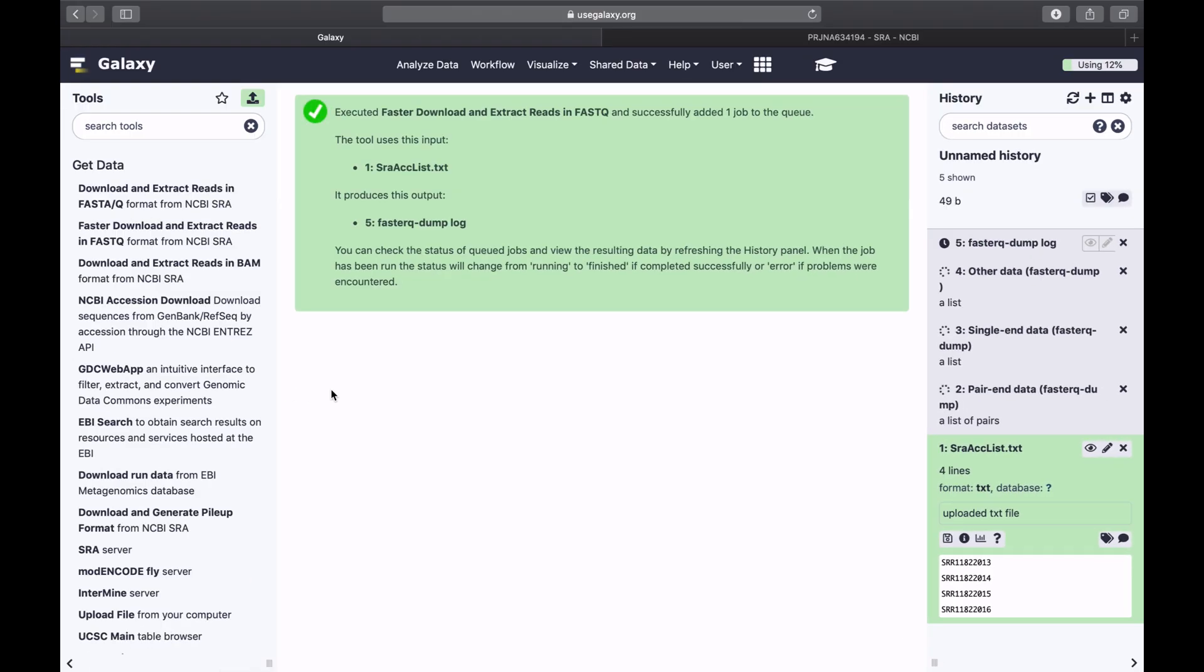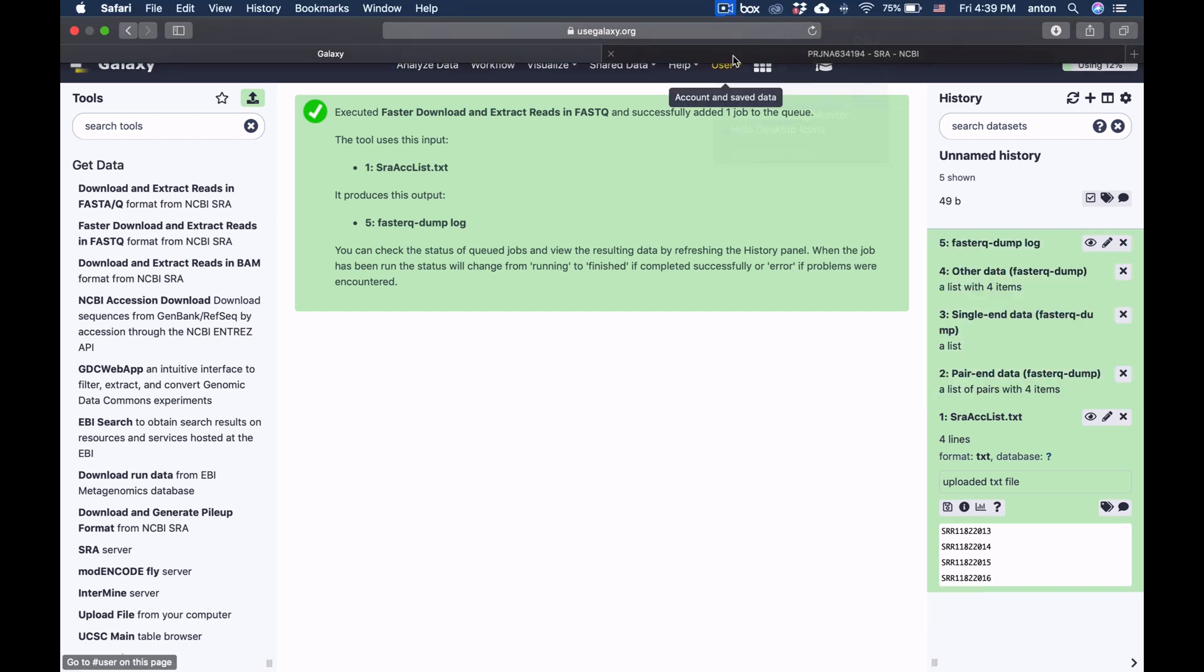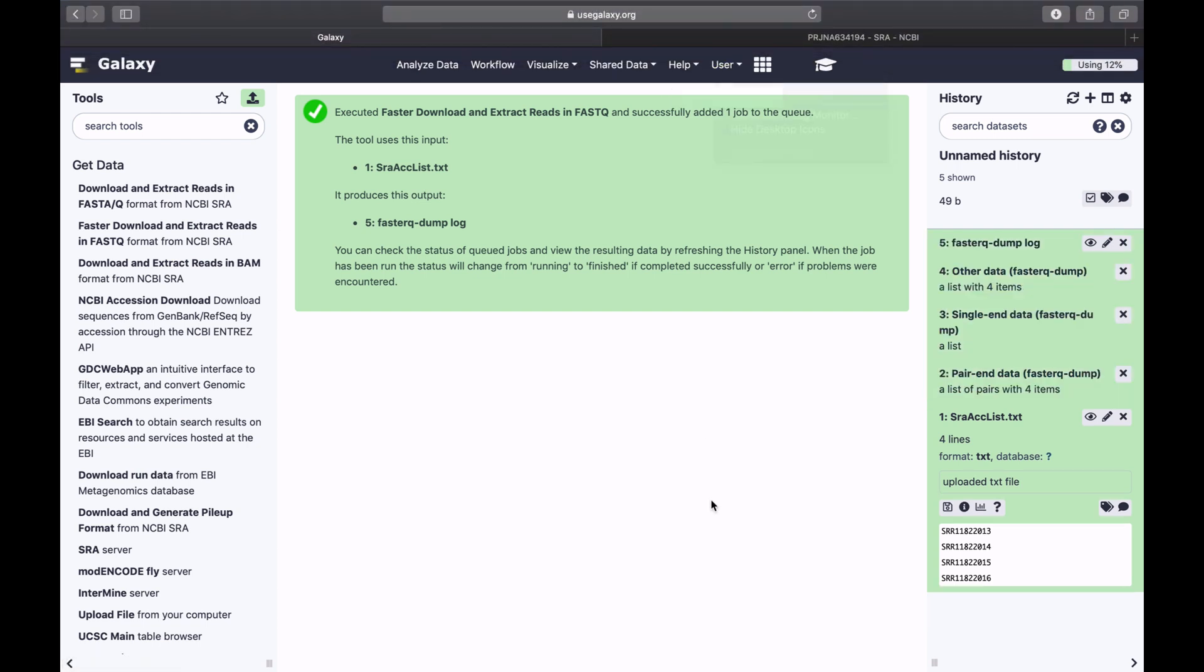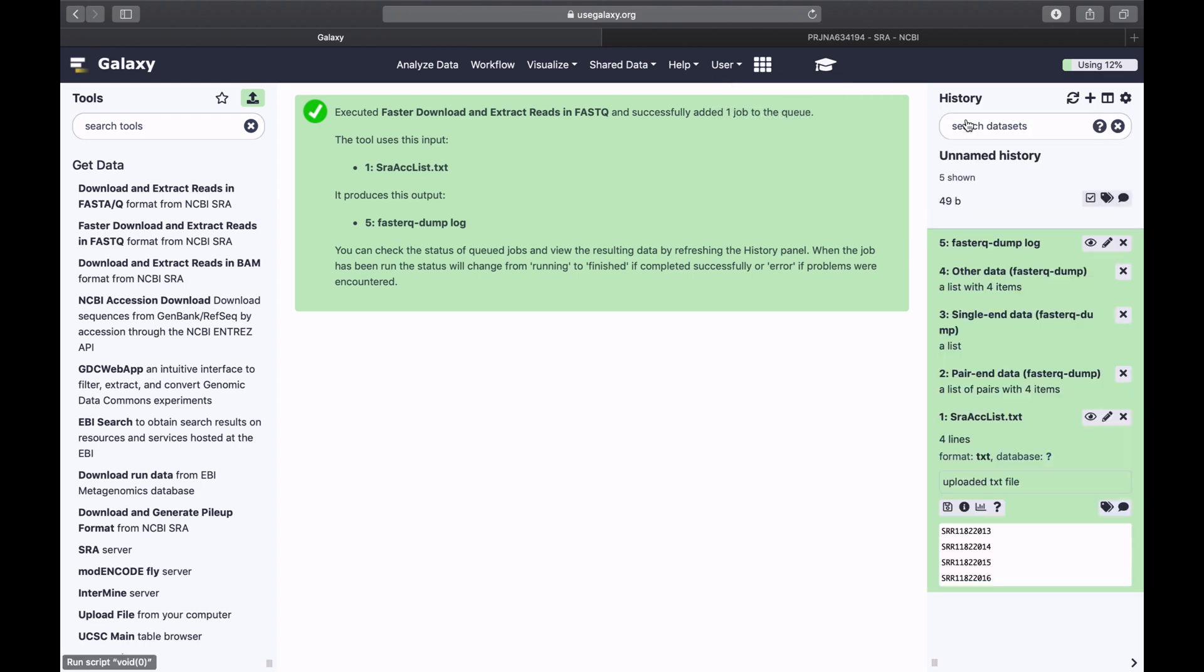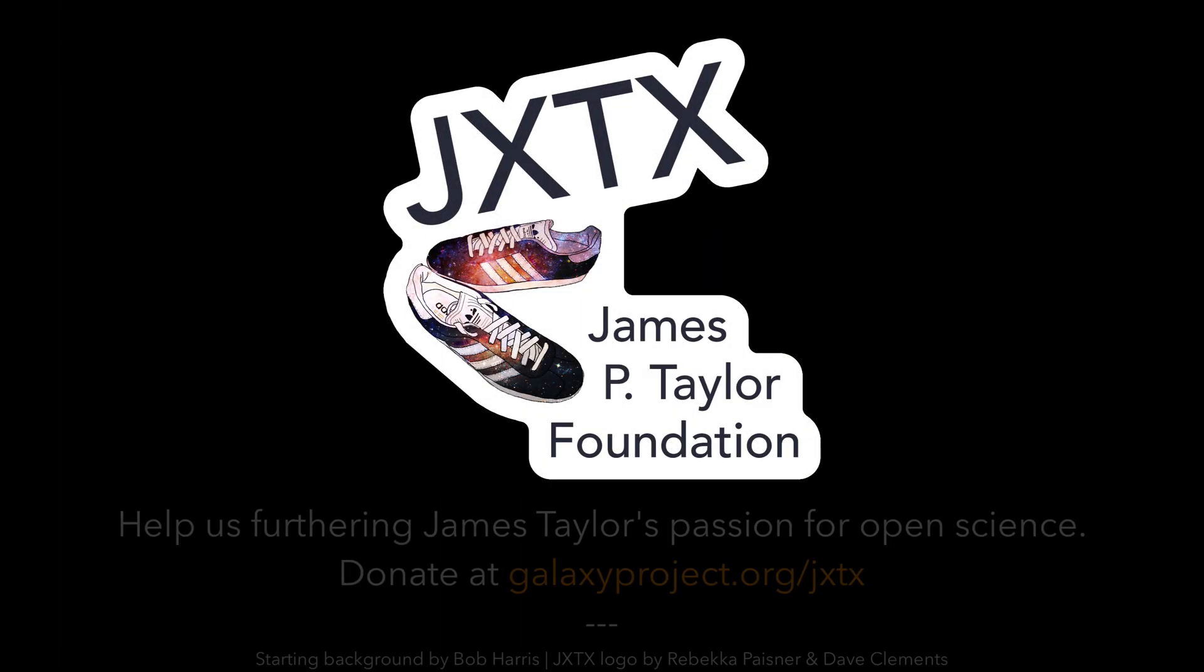What this will do, it will upload these four datasets as a collection. And here it is. It's a collection with paired-end datasets. To understand how to use and create collections, watch a series of videos dedicated to that subject.